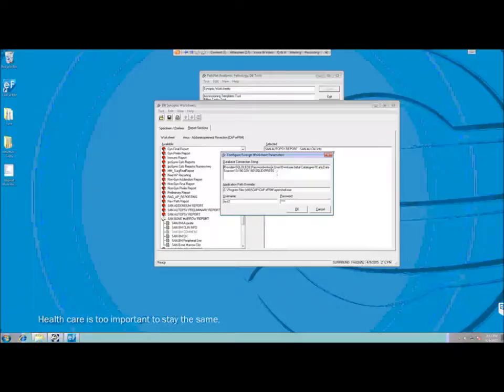So we have added a few settings here. So the first one is the database connection string. That basically tells Millennium the location of the local mTuitive database, and it will use this to pull in the worksheets. And then the other settings you're seeing are used on result entry sessions, and some of them are optional.